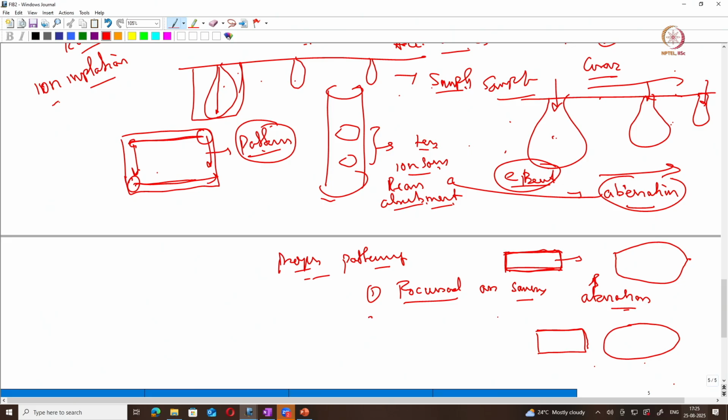If you have a stigmated beam, astigmatism, this is also very important because it also has electrostatic lenses due to which astigmatism may form. So your beam is not focused, correct, and due to astigmatism you may get distorted sputtering of that particular pattern or shape.